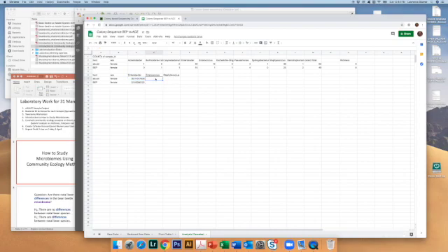Let's do the same thing for Enterococcus. For Enterococcus, this calculation should be, I'm going to give an open parenthesis, the value for Enterococcus divided by the total, close paren, times 100. And then we can simply drag that value down and we'll get the next value, which is 1 divided by 49 times 100. It's only 2%. And then let's do the last one. And actually, I want to just double check here. Yes, this is doing what we wanted it to do because that value should be M4, and it is.